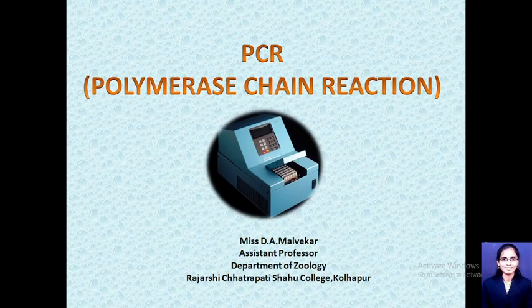Hello, friends. In the corona pandemic period, we came in contact with words such as RT-PCR technique, in which the doctor or the technician was taking our swab, and then the swab was tested by a certain test, and then the result came whether the patient is positive or negative, right? So we are going to study one very interesting technique which is used in the forensic lab as well as in the virology or bacteriological testing lab.